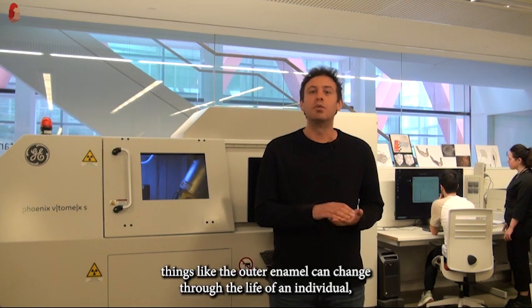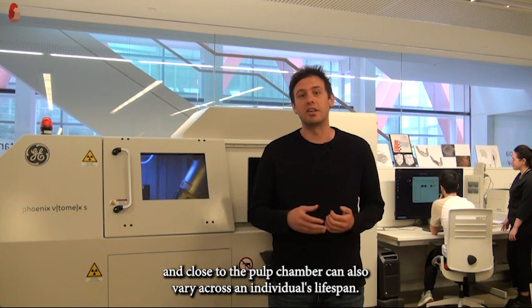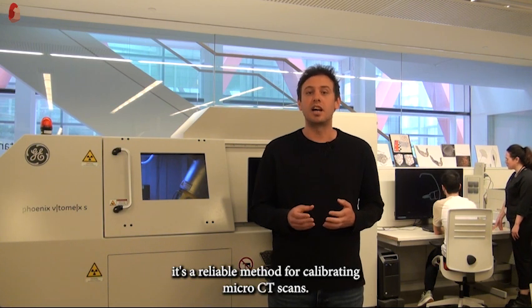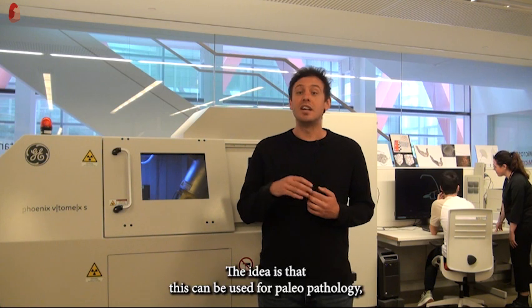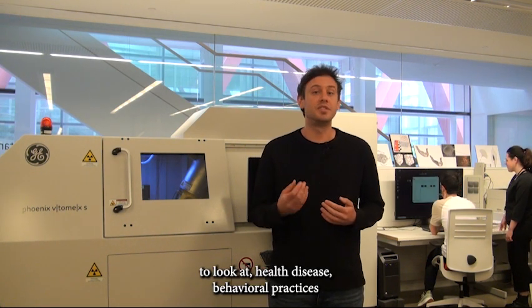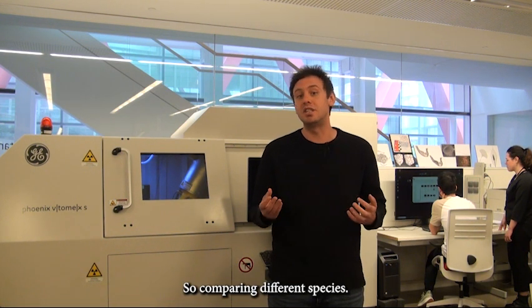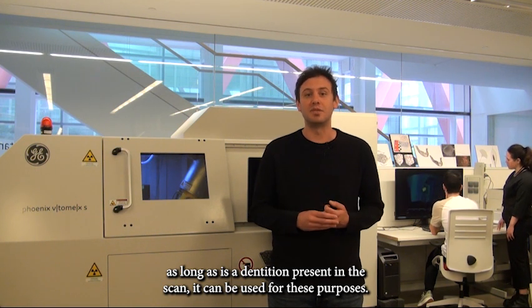Things like the outer enamel can change through the life of an individual, and close to the pulp chamber can also vary across an individual's lifespan. So as long as these very particular areas of the enamel and dentine are recorded, it's a reliable method for calibrating micro-CT scans. So the idea is that this can be used for paleopathology, so to look at health, disease, behavioral practices of past populations, but also can be used in evolutionary studies, so comparing different species. As long as there's a dentition present in the scan, it can be used for these purposes.